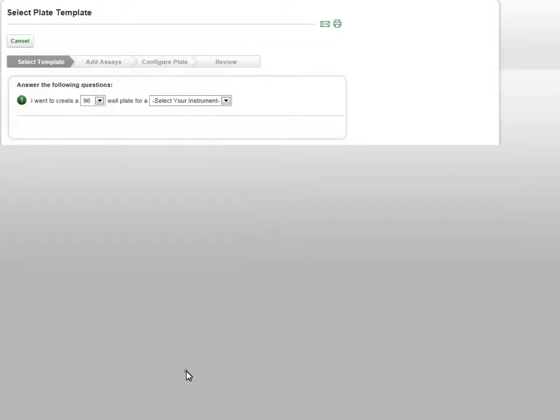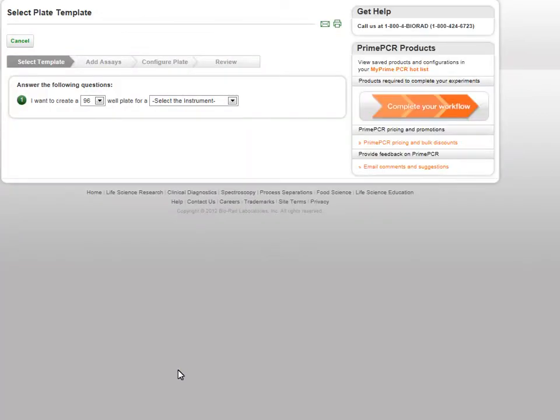The Custom Plate Wizard will ask you a series of questions to help you begin. First, select either a 96 or 384 well plate, followed by your instrument.